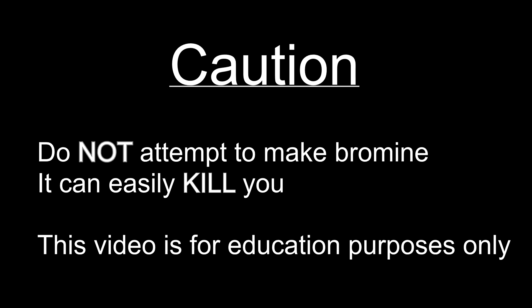Bromine is extremely dangerous and its synthesis should not be attempted. This video is for entertainment purposes only and you should not recreate anything you see. Like chlorine, bromine is extremely dangerous and it can easily kill you.